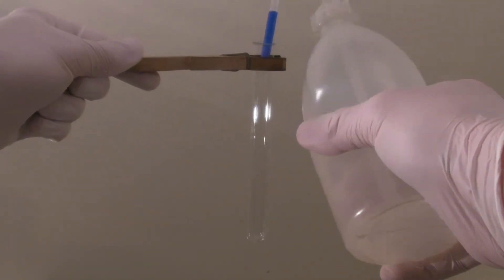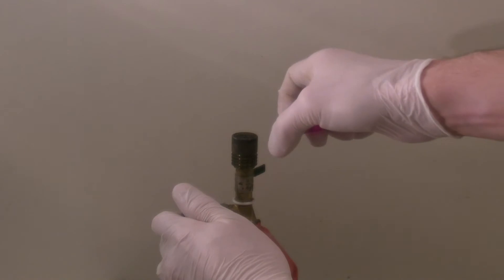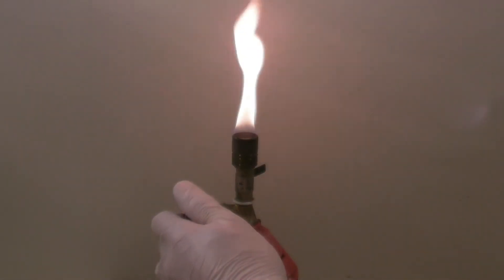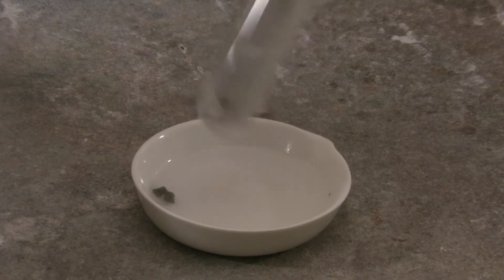The test tube is then filled with water and the Bunsen burner is ignited. Next, the test tube is first held into the solution and then held into the flame of the Bunsen burner.